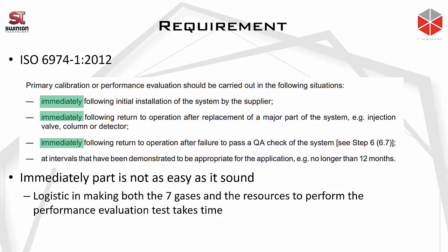The majority of operators that perform this test are located either in the UK or generally in Europe. So it's not really widespread in terms of the actual performance evaluation test across the globe.